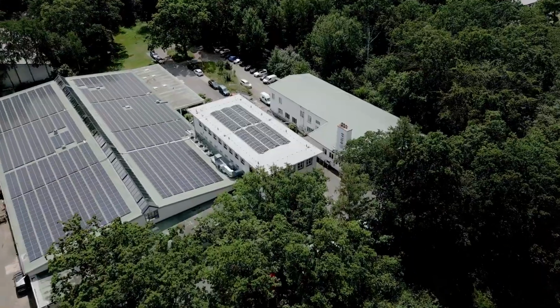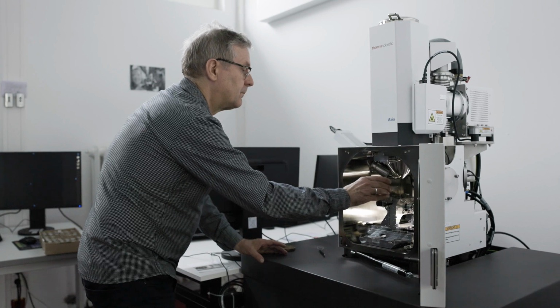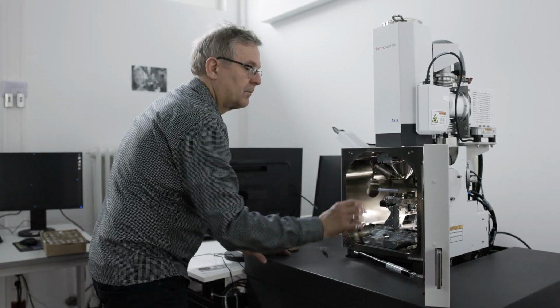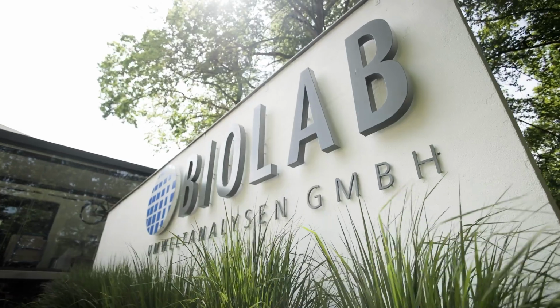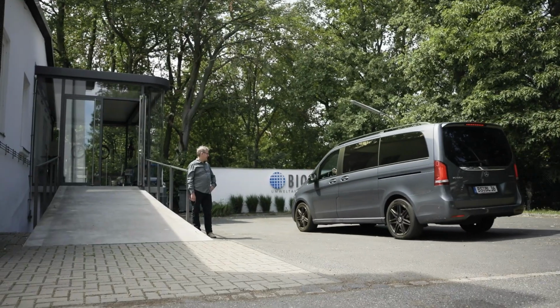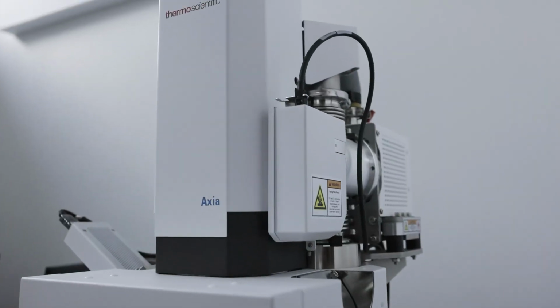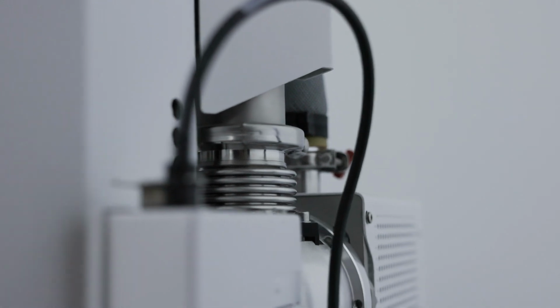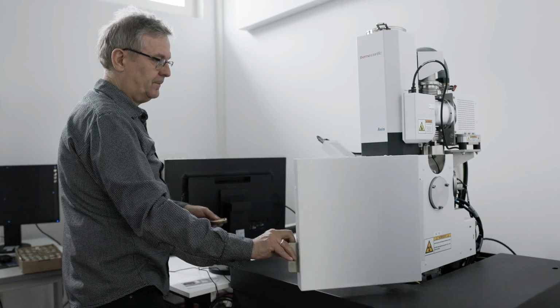The main context of our research field: does a material, or does an air sample, or does a dust sample contain asbestos or not? The SEM technology plays the main role in the asbestos analysis. Working with the Axia ChemiSEM is, for me, like feeling at home. And the Axia is used mainly for special analytical questions.